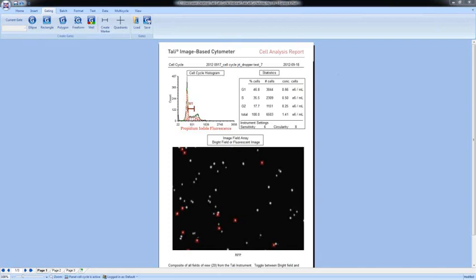And another question about the 2 different channels to identify various populations. That's something you can certainly do in FCS Express Image Cytometry, just like you would do with flow cytometry. In this particular data set, we're actually only dealing with 1 channel of fluorescence, but you may have noticed when we were showing multiple parameters such as size, perimeter, and circularity, that we could work with many parameters at the same time. So that will go for any of the fluorescent channels that you have with the data as well. So if you have 2, maybe 3 fluorescent channels, you can certainly create as many different gating strategies or look at as many different parameters versus each other as you'd like.